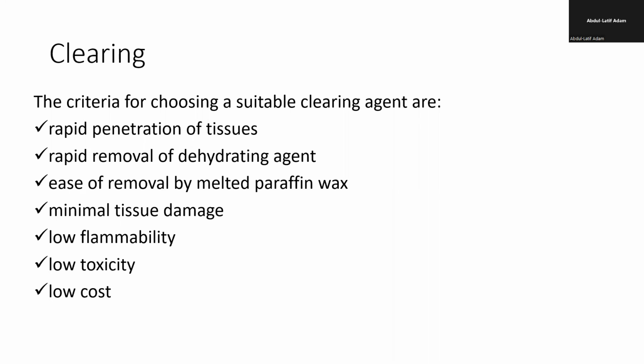It should also have the capacity to remove the alcohol that was used for dehydration. It should also be miscible with the embedding media, and it should not cause so much damage to the tissue. It shouldn't catch fire frequently, so low flammability, okay? And it shouldn't be very toxic.